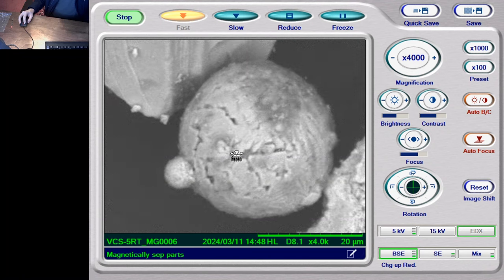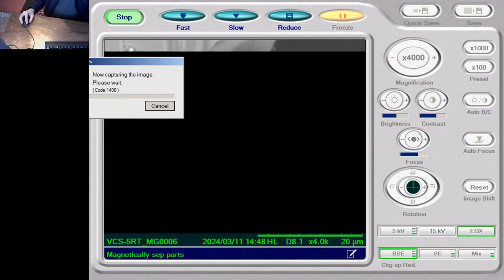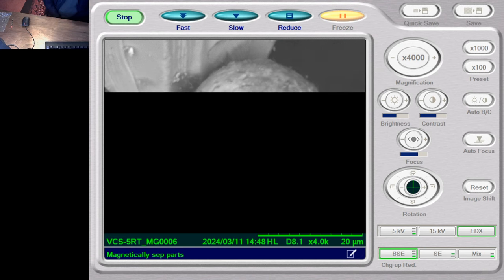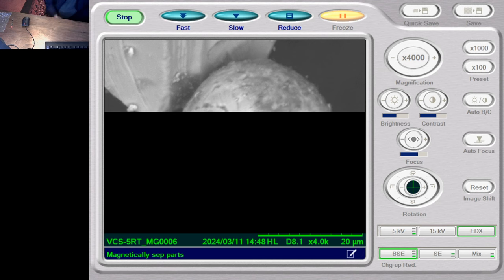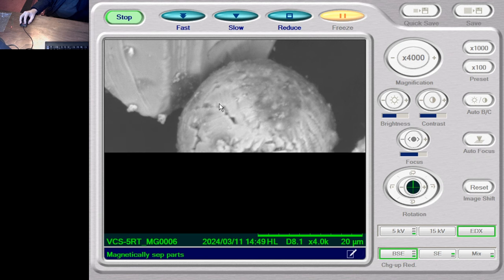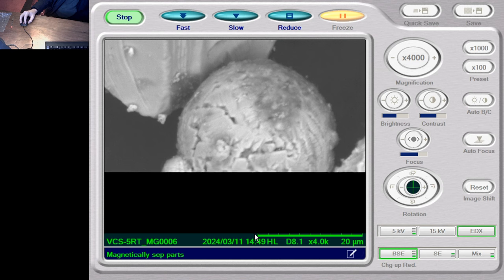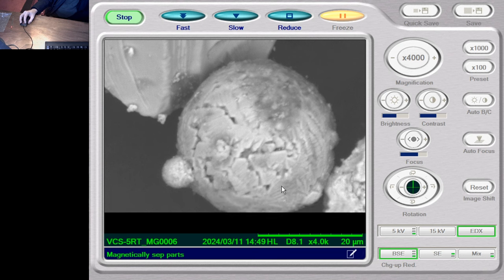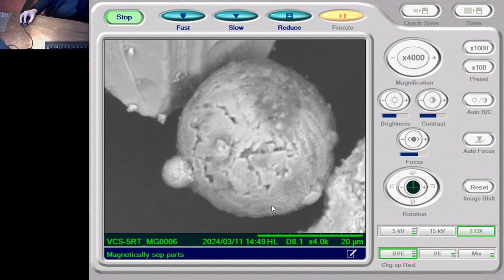You can see the crenellations here. Pretty sure this is going to be mostly iron as well. Yeah, look, you can see the divisions here. 1, 2, 3, 4. They're probably the classic kind of size. This is 20 micron, 10. So it's classic sort of 1 micron divisions. See, round about a micron, just over a micron. There we go. Same, same, same.